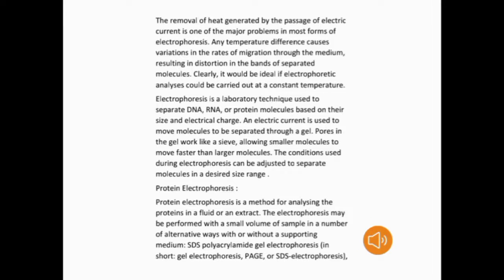The removal of heat generated by the passage of electric current is one of the major problems in most forms of electrophoresis. Any temperature difference causes variation in the rate of migration through the medium, resulting in distortion in the bands of separated molecules. Clearly, it would be ideal if electrophoretic analysis could be carried out at a constant temperature.